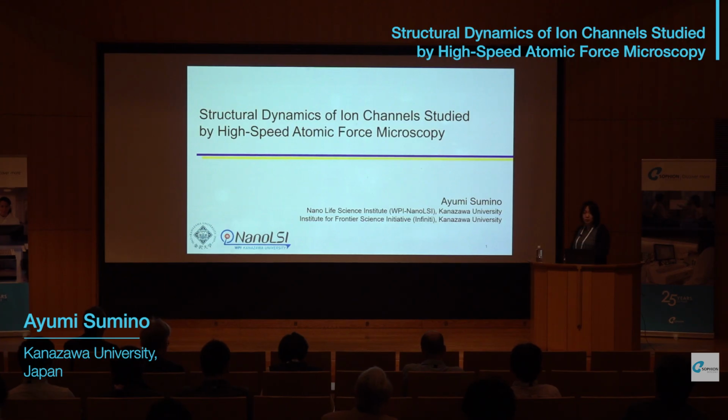First of all, I would like to thank the organizers for giving me this opportunity to talk about my recent research. I'm using a high-speed AFM technique for studying ion channel structure and intermolecular interaction. Today, I will show you an example of application of this microscope for ion channel study, especially on voltage-gated sodium channels.